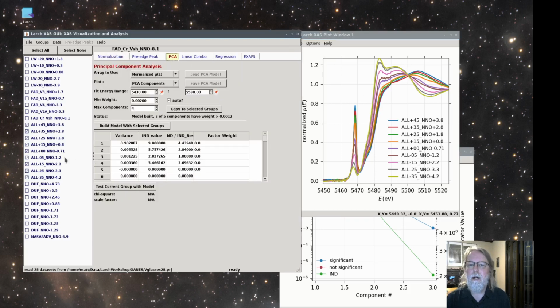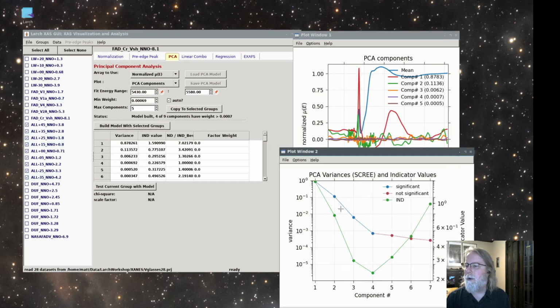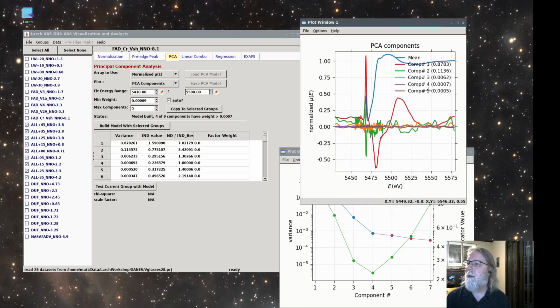I think it's 9 spectra for this set. And here it looks a little bit more like there's some more variation, but if we look in detail, we see that actually these first few are clear and everything else is a little bit noisy. So maybe, again, there might be a third component, but maybe it's reliable to think of those as only 2 separate components, or three separate components instead of 4.